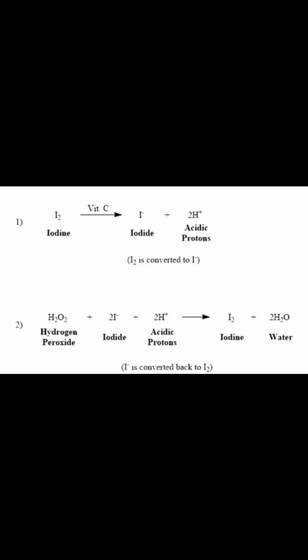Well, in this chemical reaction, the timing is a very important part of the project. The process is basically to mix two transparent liquids, which are the two solutions that we are going to work with throughout the experiment, and with this you will have a redox reaction.